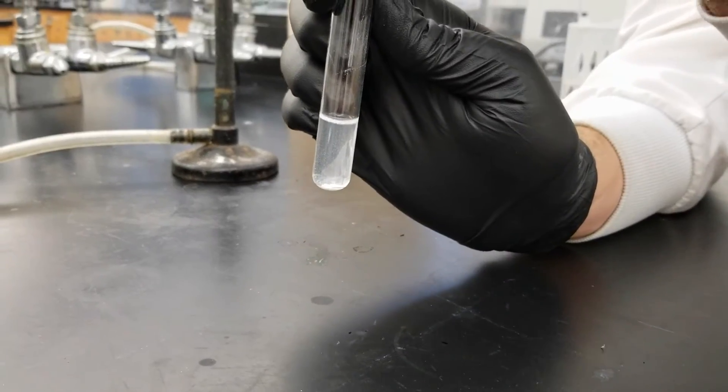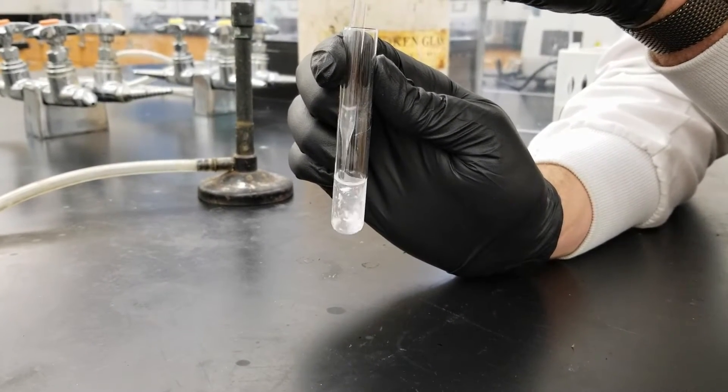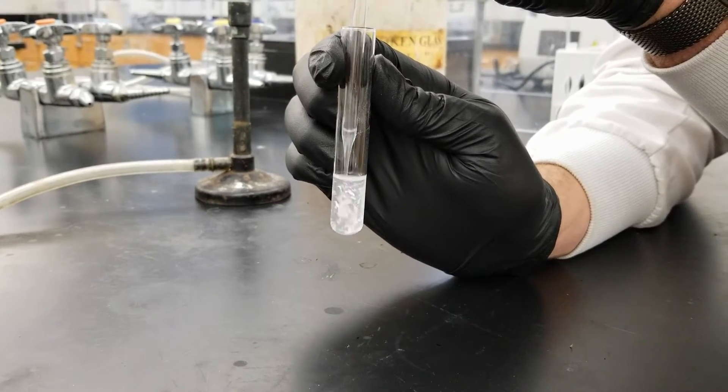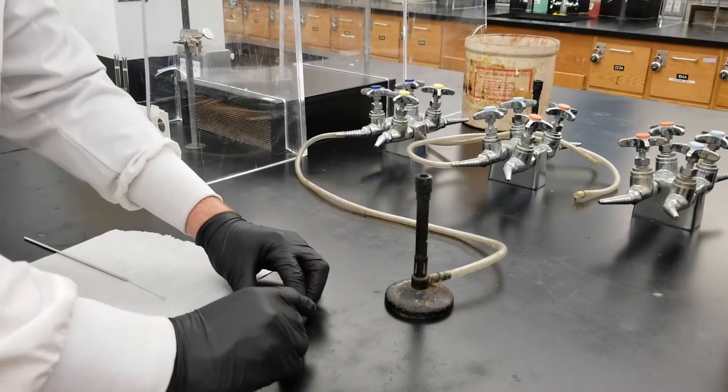For the second part of this test you'll be combining your magnesium product with water so pay attention to whether the solid dissolves and also the pH of your solution. The second test will involve heating a test tube.